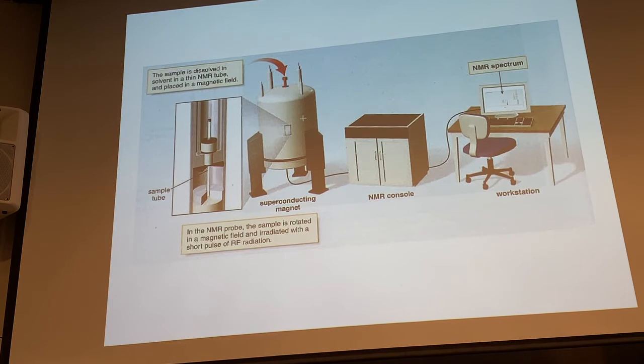Okay. Remember, the basics of analytical chemistry still hold here. The problem is we're looking at parts per millions of wave numbers and frequency numbers, which are very small, okay, relative to the magnetic field frequency. So we need very sensitive electronics. The electronic console here is part of the cost of this instrument, which is very expensive, $1 million or so for a simple high field instrument here.